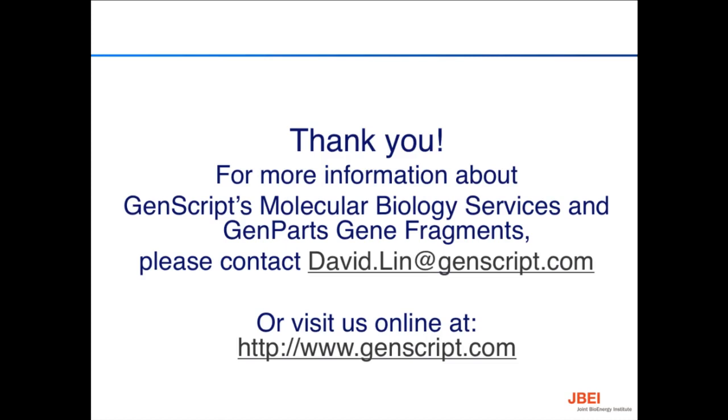Yeah, so there's some things to think about. To a large extent, for the flanking homology style methods, in terms of commercial kits, we've been using some of the Gibson assembly mixes, either from SGI or from NEB. And then we've also been using Infusion.